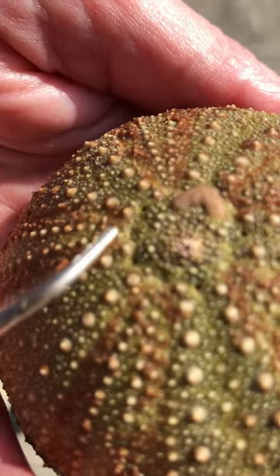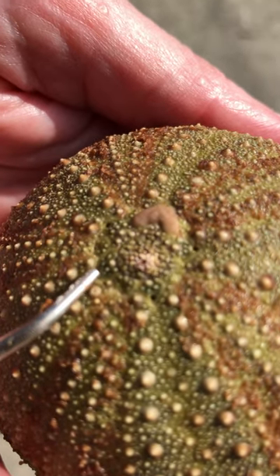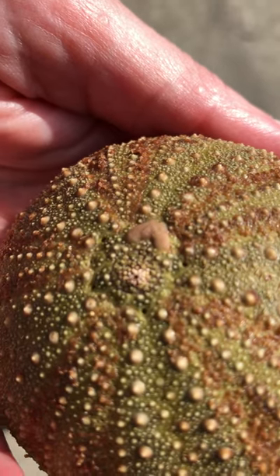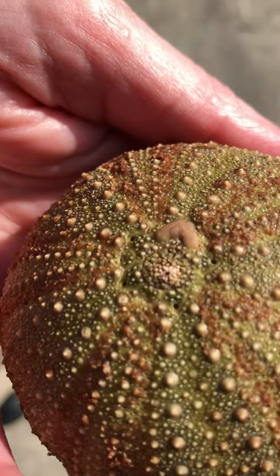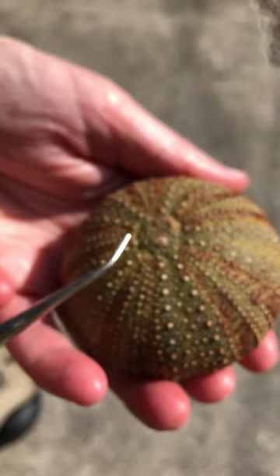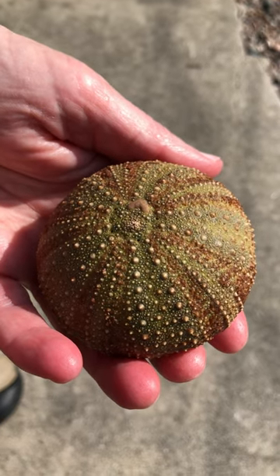The madreporite, and then one, two, three, four, five genital pores. There will be five gonads radiating in the internal anatomy, and when those gonads are producing sex cells — sperm and eggs — they'll be released out of these genital pores. That's it for the external anatomy of the sea urchin.